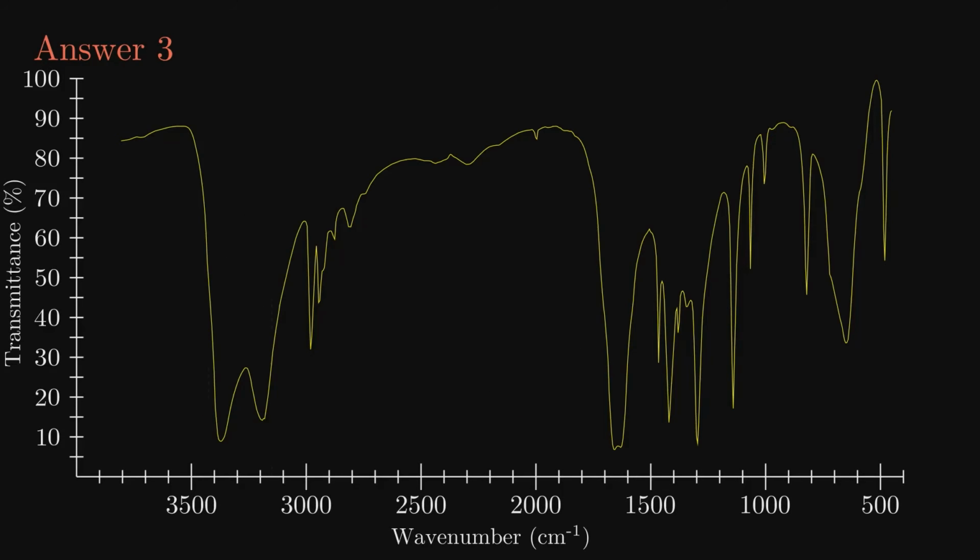This IR with the set of peaks on the far left has the telltale sign of NH bonds. There are hydrogens on sp3 carbons again. The peak between 1700 and 1600 is really intense, so it is likely a carbonyl. We see the usual peaks that show the presence of sp3 carbons and CH3. The peak just above 1100 could be a carbon-oxygen or carbon-nitrogen single bond.